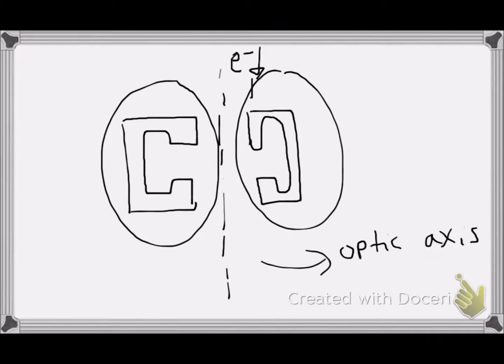The first thing this radial field does is give the electron some angular velocity, beginning to curve the electron's path. As the electron continues on its angular trajectory, it nears the optic axis. As the electron continues to the center of the lens, the angular velocity encounters the Z field, which produces a radial force pushing the electrons toward the center of the lens, like so. It actually does a little loop around the optic axis as a result of the angular and radial velocity. As the electron leaves the center of the lens, it first loses its radial velocity, then its angular velocity, but picks back up linear velocity and is on a trajectory to reach a central focal point.